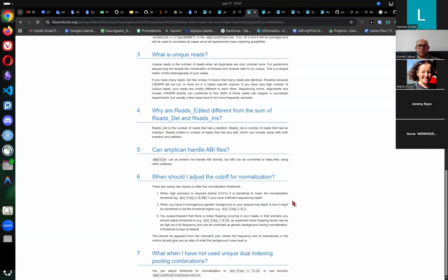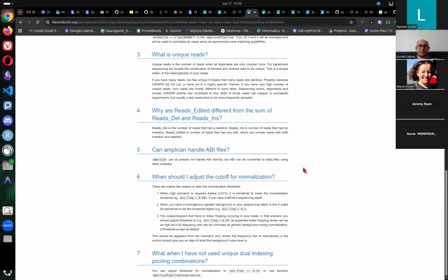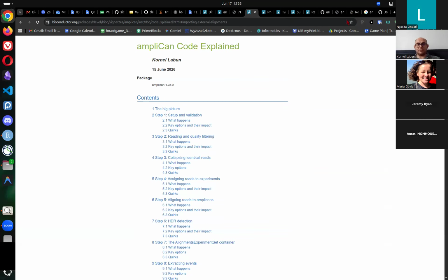So if you don't have complicated files, you just have a smaller config file base. So for many of those, the software works. You will see in a moment. Okay, so now you know where to find it: all available already online on the devel branch. Or you can just grab it from GitHub if you need it.